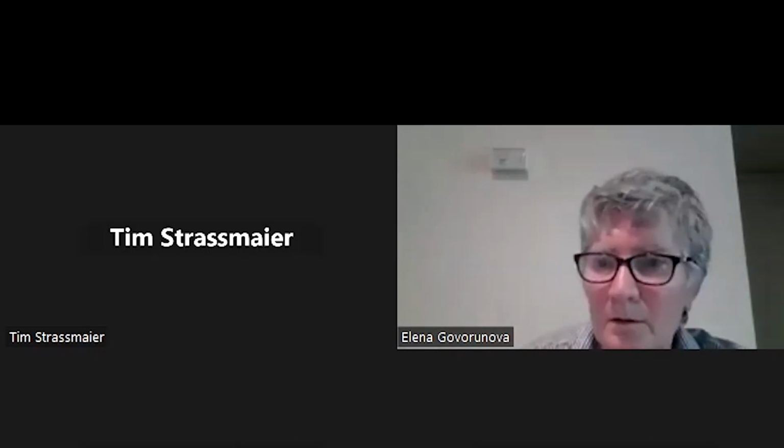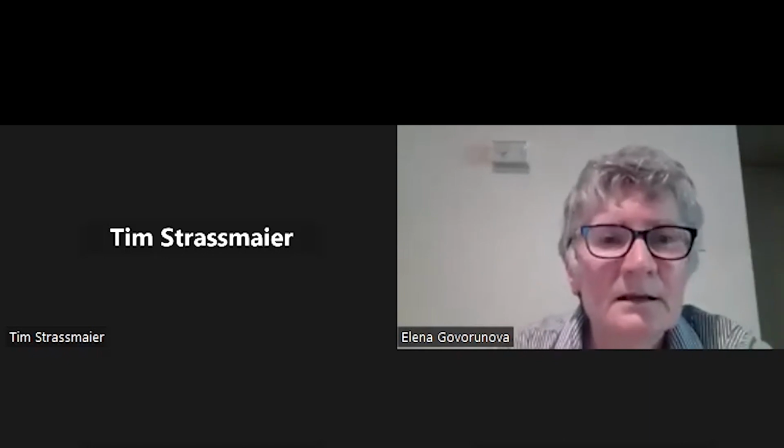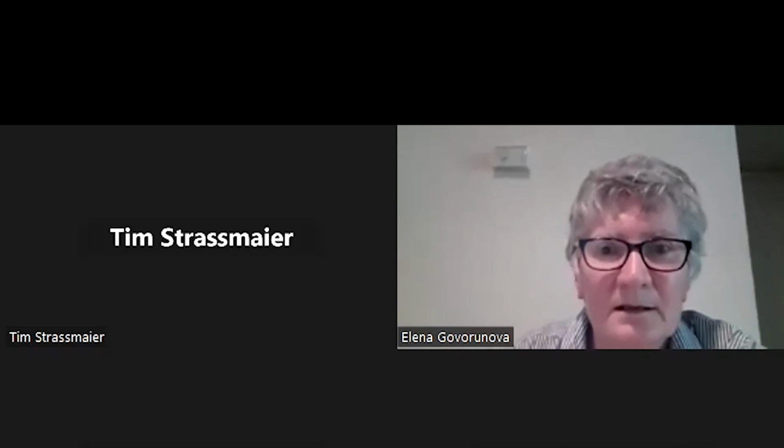Hello everybody. I'm Marcus from Nanion Technologies. Thank you, Elena, for this fantastic talk. I have a question related to the insertion of the Channelrhodopsin, for all of them, actually, because you put the protein in a eukaryotic cell system. Is there anything known about interaction of cell metabolism and the Channelrhodopsin that could modulate the activity, like phosphorylation or lipid metabolism?